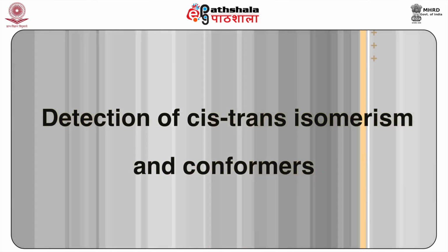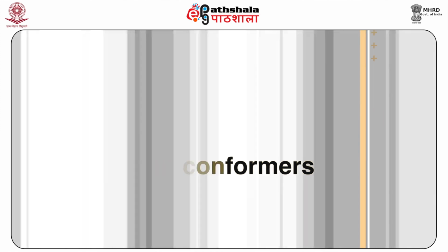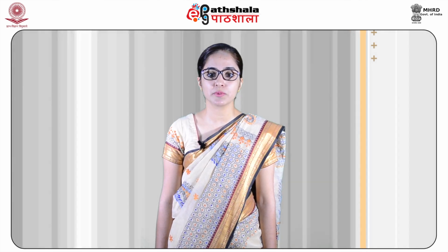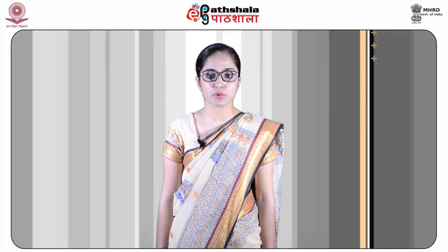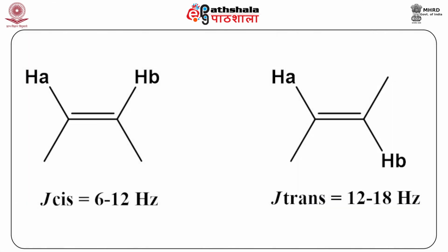Now, the third application is the detection of cis-trans isomerism and conformers. Proton NMR spectroscopy can be easily helpful in distinguishing between cis and trans isomers because the concerned protons have different values of chemical shifts as well as coupling constants. For isomeric olefins, J trans, that is the coupling constant for trans protons, is always greater than the coupling constant for the cis protons.